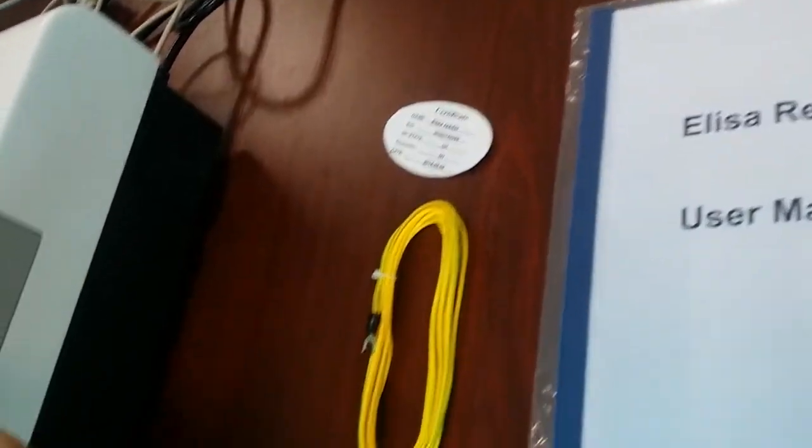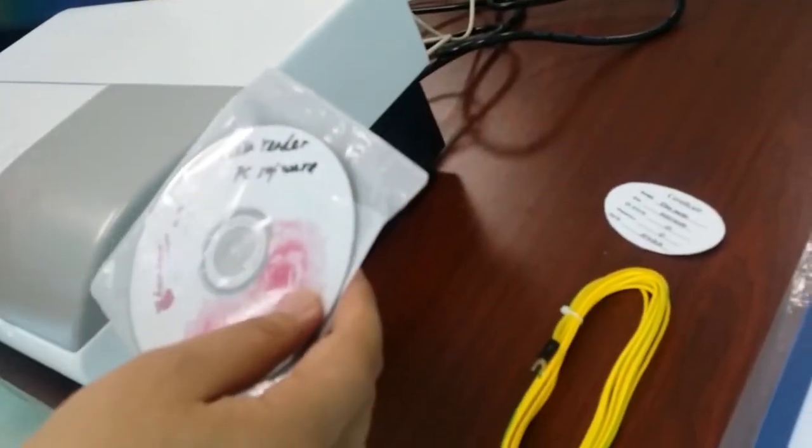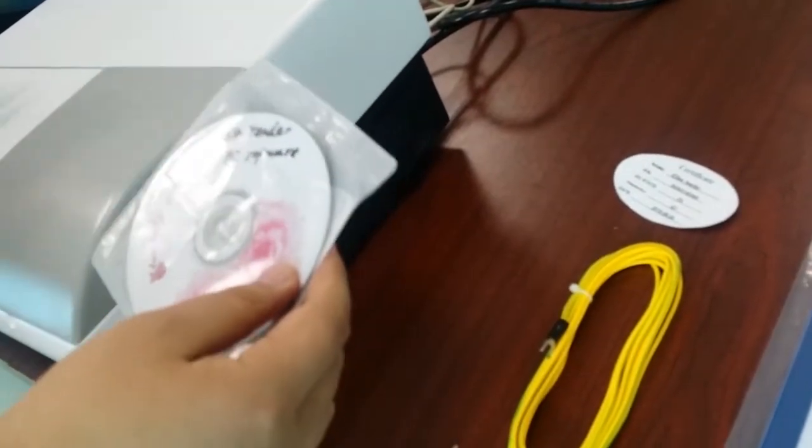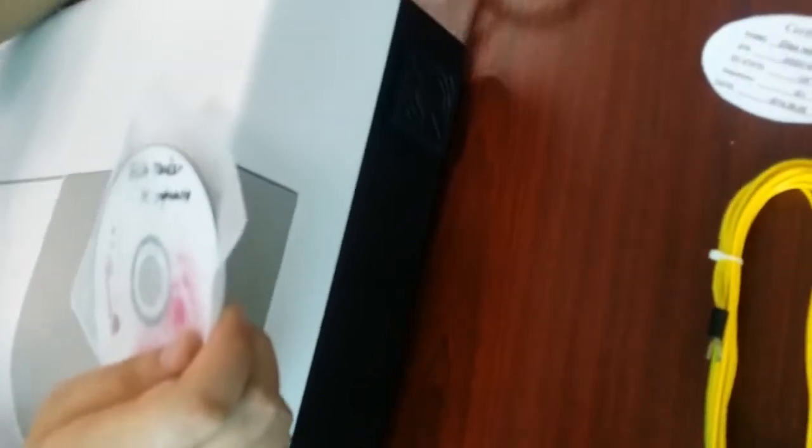This is the software which you should install on the computer. You need to run the software for this machine to operate. Now we just turn on the power of the machine and check the indicator light to see if it is lit.